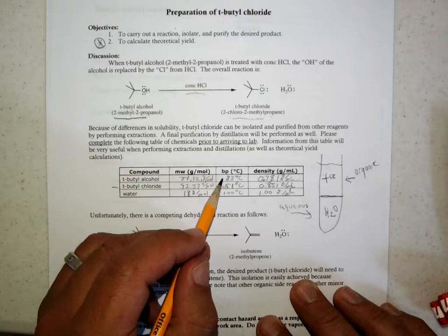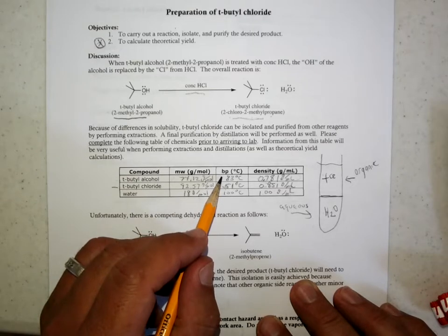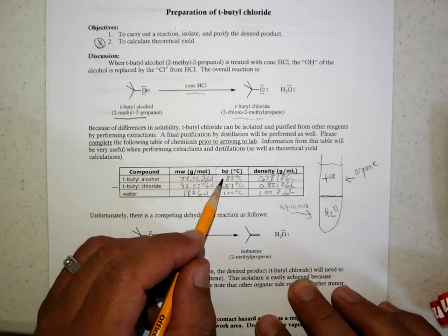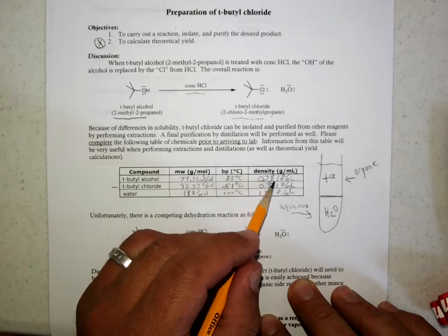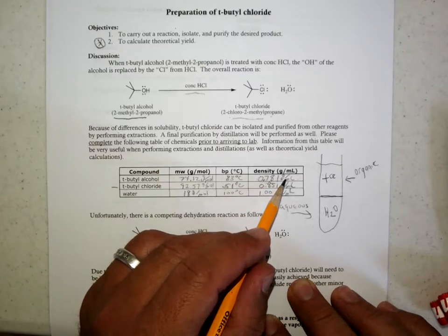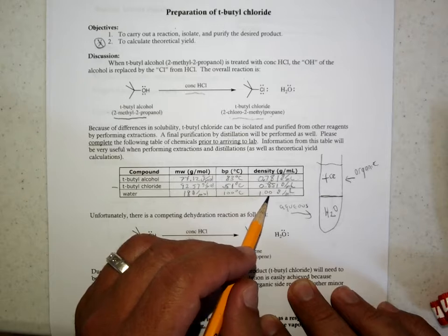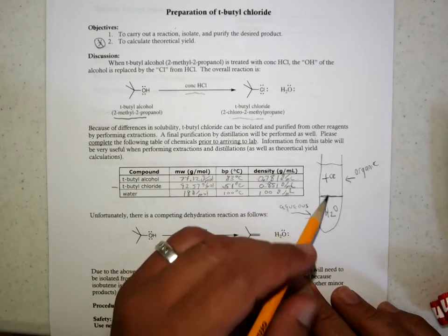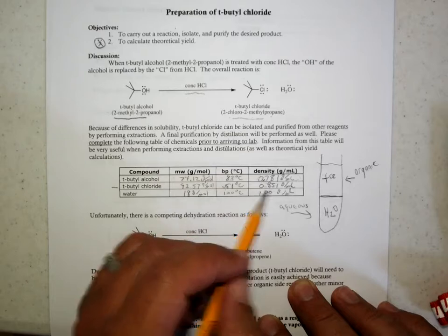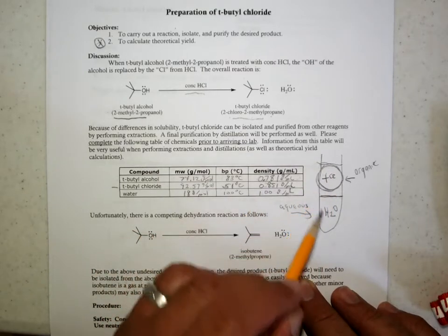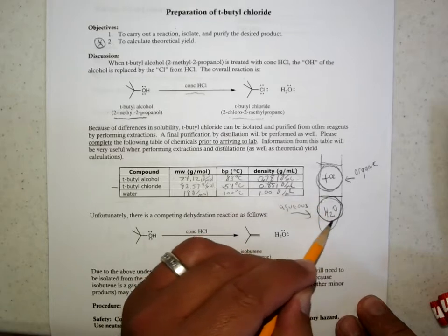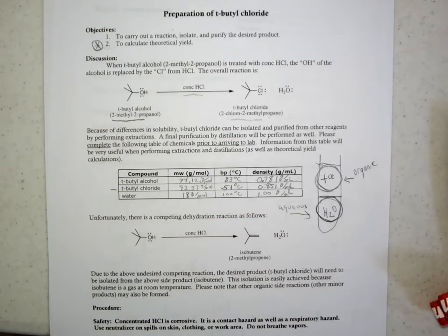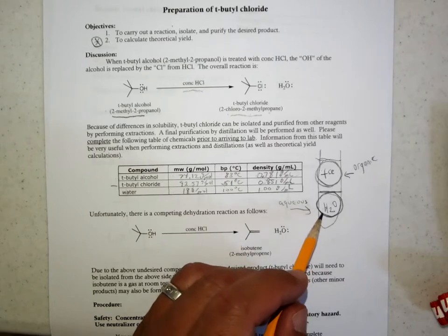The boiling point is really important in terms of can you separate it from other liquids using a distillation. And then the density is good for a couple reasons. One is the 0.781 grams per milliliter is a lower number than the 1 gram per milliliter of water. So the organic layers, having lower densities than water, would float on the top. If you do an organic reaction, you usually use something dissolved in water to wash the organic layer or as a reactant, and that'll sink to the bottom of the reaction vessel.